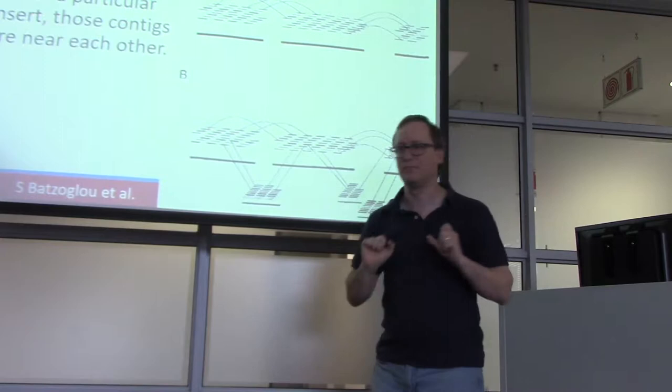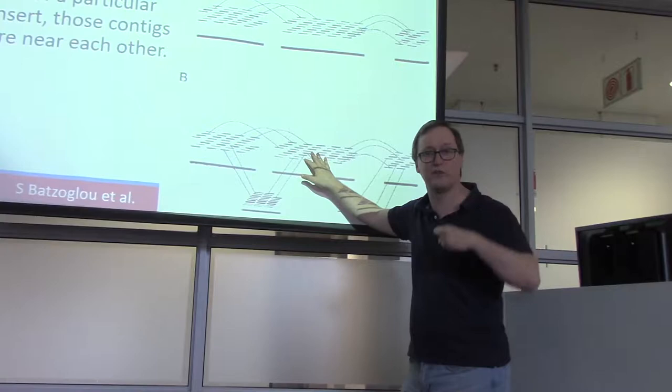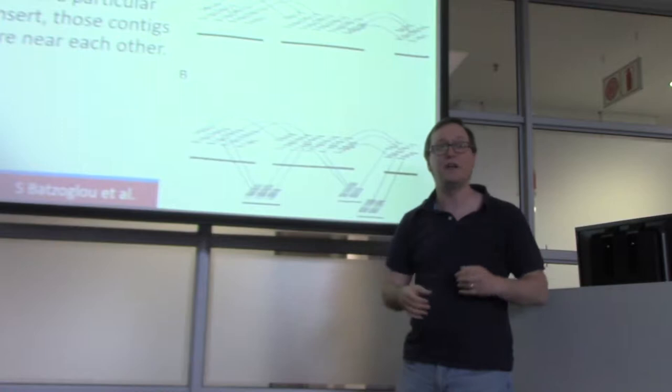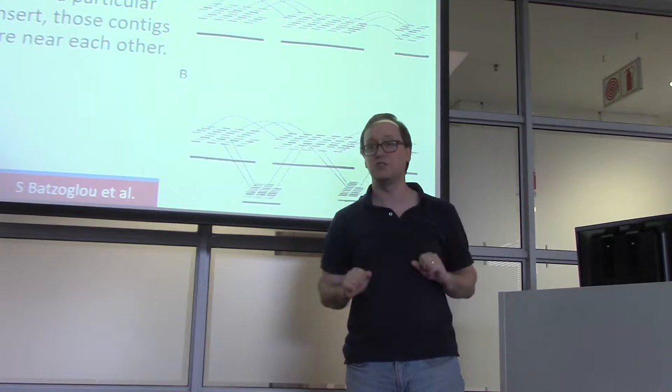So if you have a contig, you stitch together a bunch of contiguous sequence from these reads, and another contig over here that you've stitched together by finding a bunch of overlapping reads, you can tell that this contig is next to that contig because there are, in this case, 3 pieces of DNA that run from one contig, the patch of sequence over here, to a patch of sequence over here. That's where the value comes in. Because we know that these pieces of sequence came from opposite ends of one piece of DNA, we're able to learn how the contigs are oriented with relationship to each other.